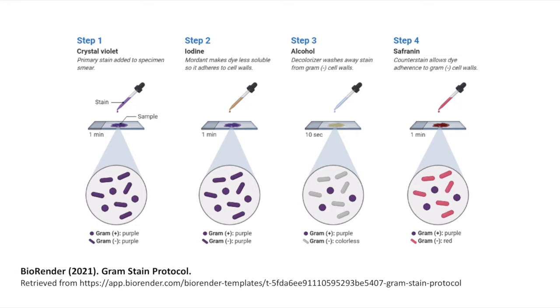A critical point to remember when performing Gram stains is that the decolorisation step is essentially a form of differentiation, and like many other types of differentiation steps performed in histochemistry, it is possible to either over-differentiate or under-differentiate. So on that basis, you can end up with negative organisms showing as positive, and positive organisms that may be over-differentiated and be misinterpreted as negative. Hence the reason for control sections is absolutely essential when performing Gram stains.